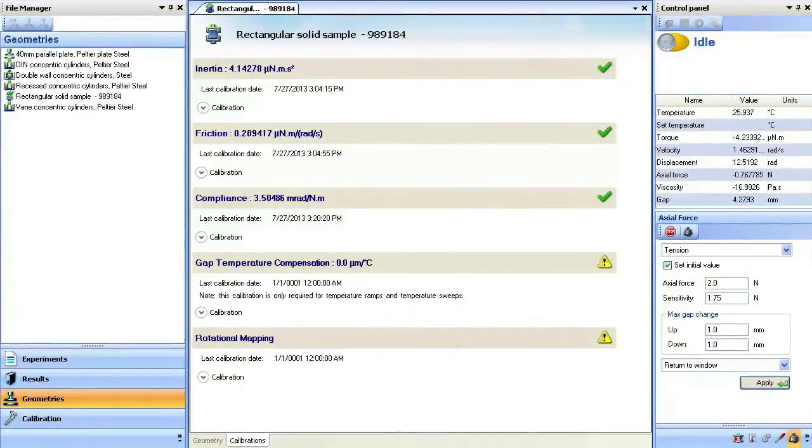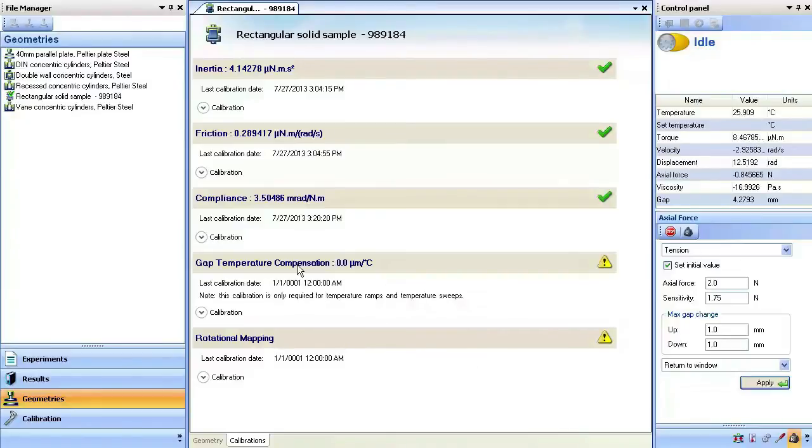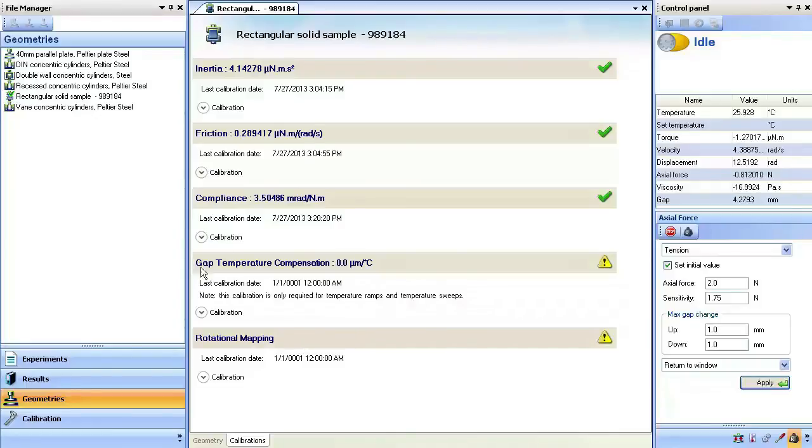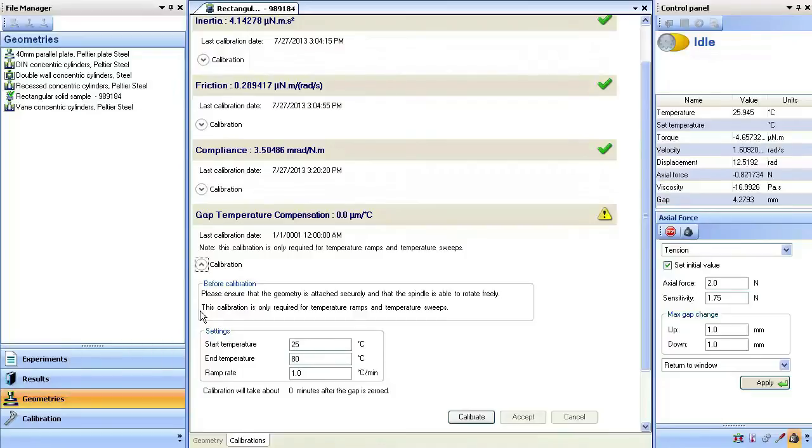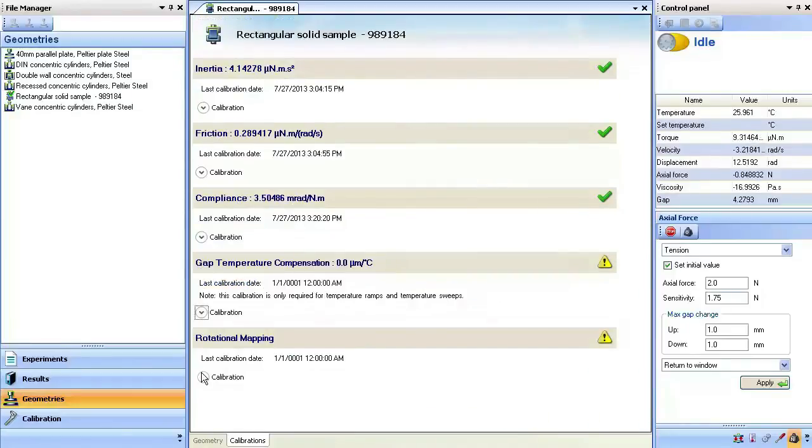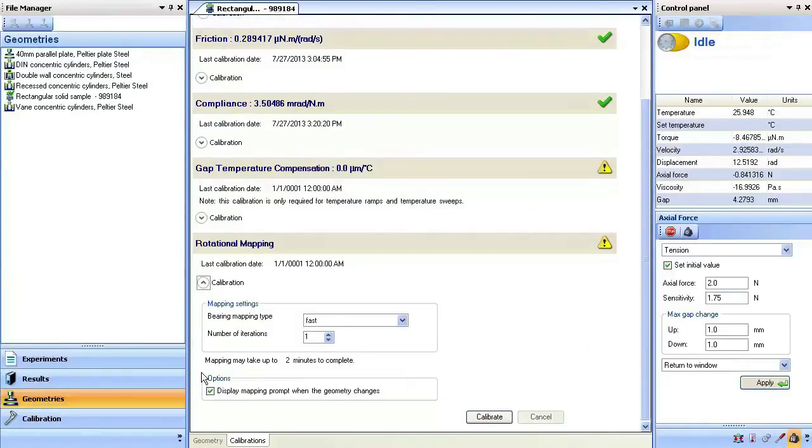There are two additional calibrations that remain under the calibration window: gap temperature compensation and rotational mapping. Gap temperature compensation is important to account for geometry expansion. This calibration should be performed with no sample but under the exact conditions desired for your experiment. Rotational mapping is considered optional when using the torsion rectangular geometry as most tests are oscillatory in nature.